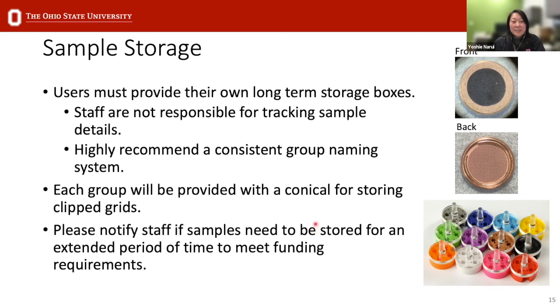And we ask users to periodically go through those and make sure they're only keeping the ones that are important for their research. Okay, I think that's pretty standard for even your own samples in your own lab. So please keep careful track of that.